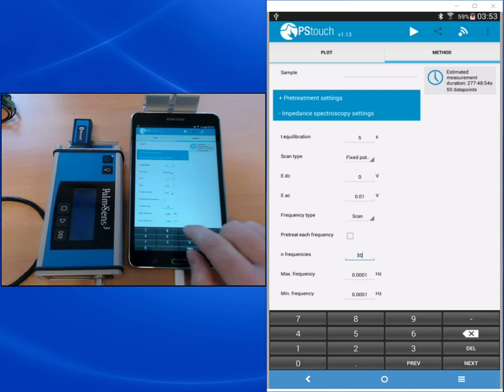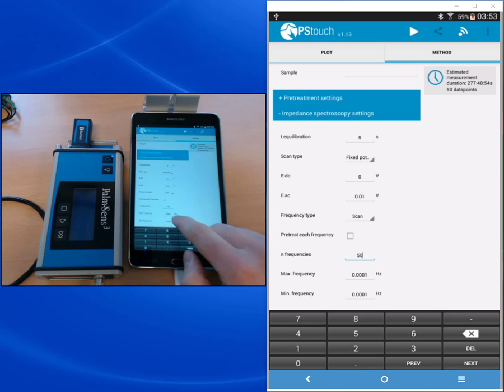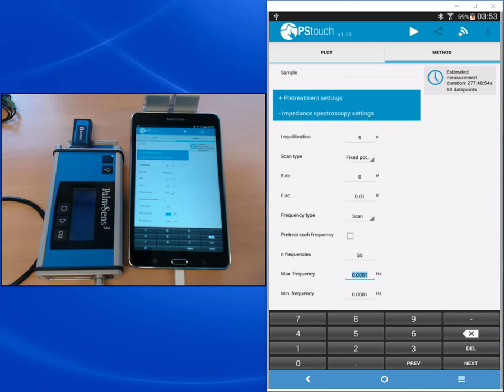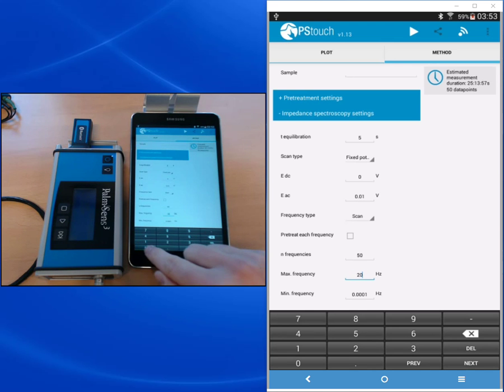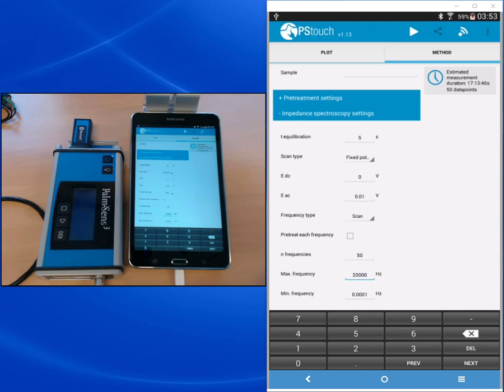The maximum frequency the Palmsense can handle is 50 kilohertz. For this measurement a frequency of 20 kilohertz is sufficient. It will give us the complete spectrum of this equivalent circuit.